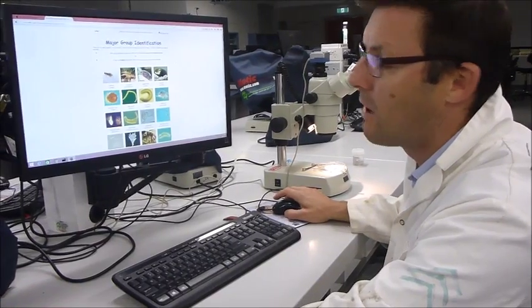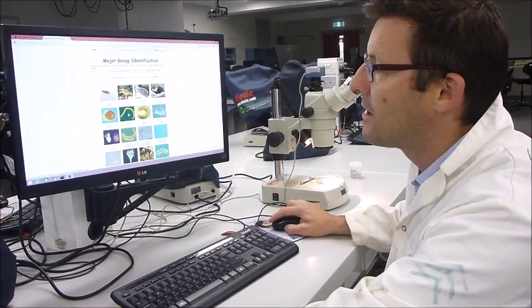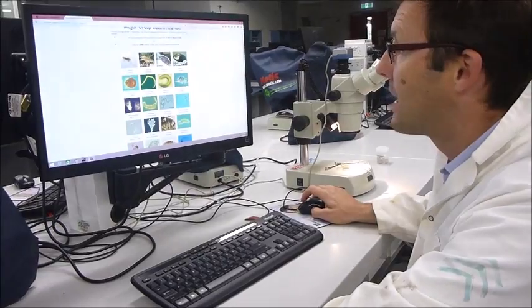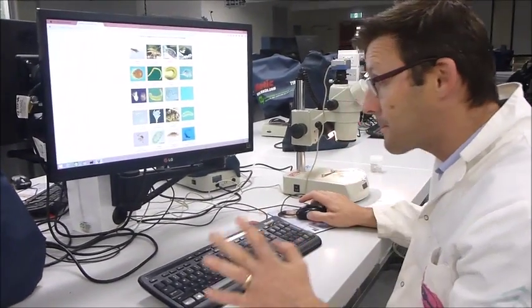So you want to identify them all to family level where possible. Oligochaetes, we just call oligochaetes. Mites, we just call Acarina. But most of the other groups you should be able to identify to family level.